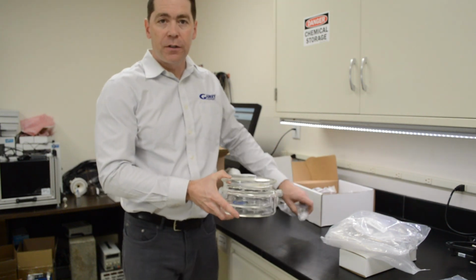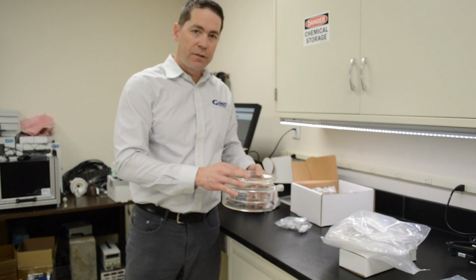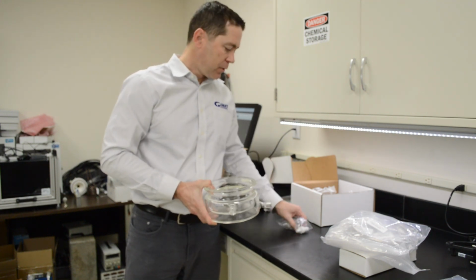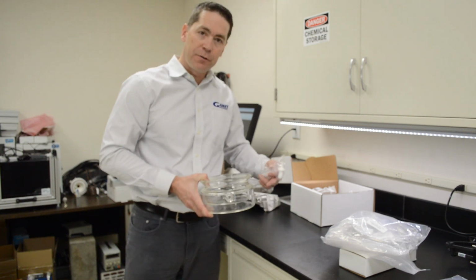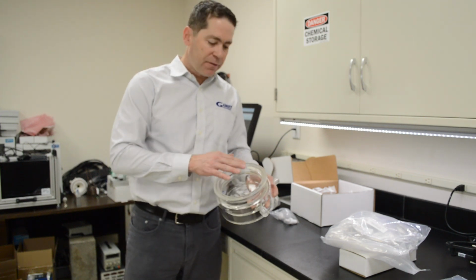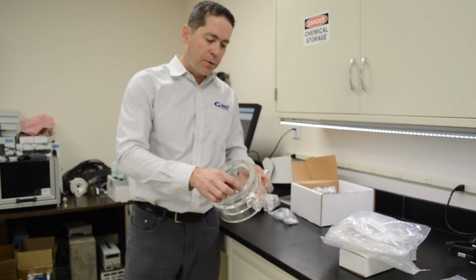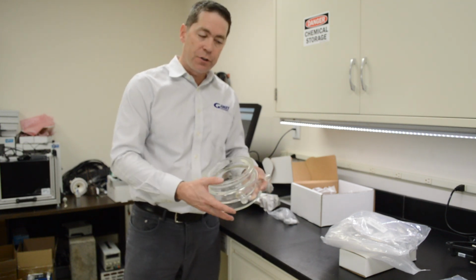Okay, so let's start with the glass cell itself. We have a 1-liter jacketed glass cell here. We have 2 ports for flow in and out. There's 2 barbed adapters, so you can hook up to your circulator if you want temperature control. The cell itself has a smooth glass surface where you're going to put the top. There is an inlay for the O-ring, which I'll show you.